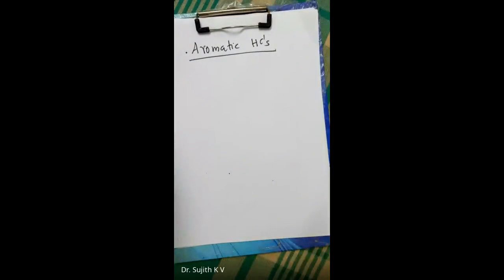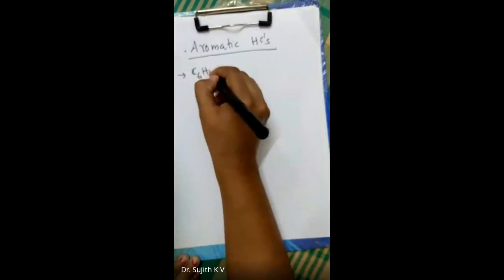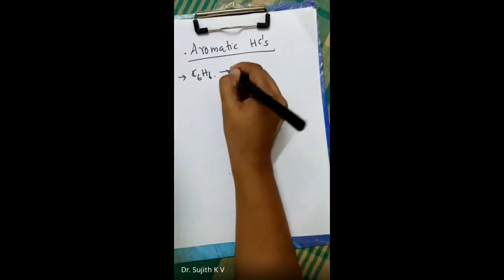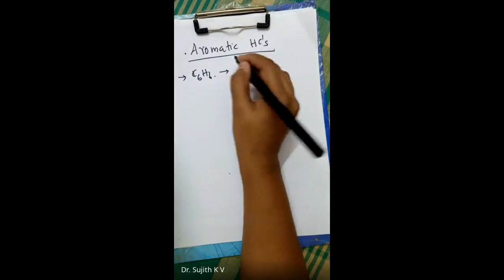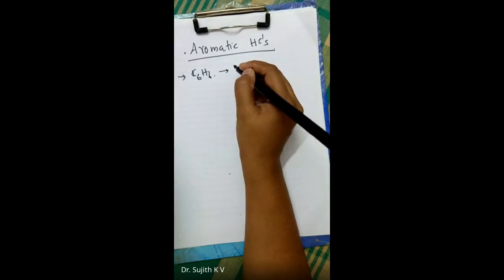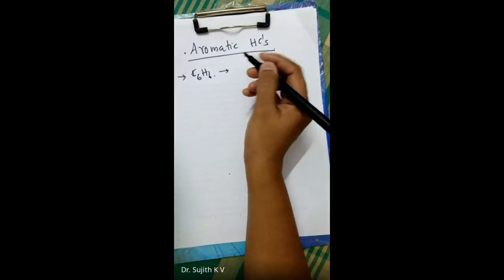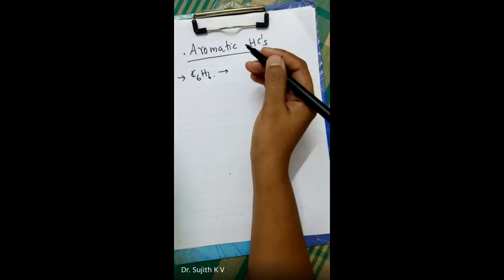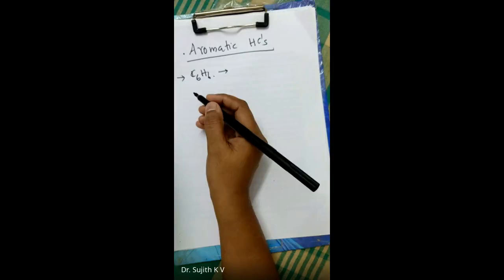The most common and important aromatic hydrocarbon we know is benzene, that is C6H6. We know that it is very much stable. That's why its fragmentation is normally not done using our normal setup. The fragmentation of benzene requires a great deal of energy, so it is not usually observed. When it is attached with a side chain, it normally gives the corresponding characteristic mass spectrum.